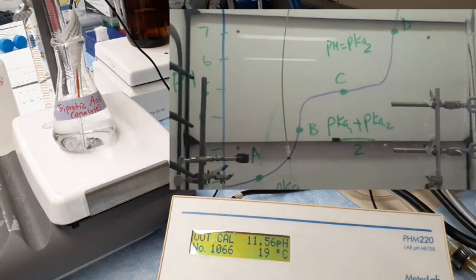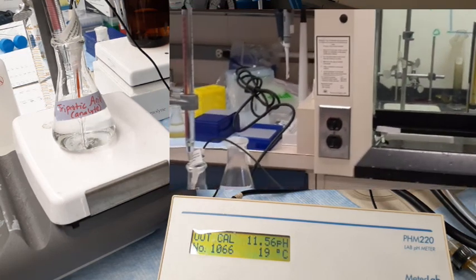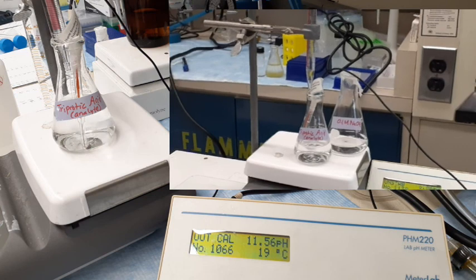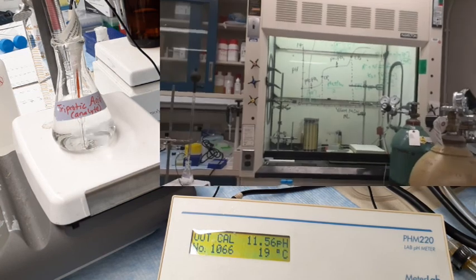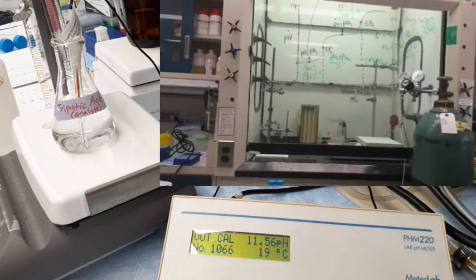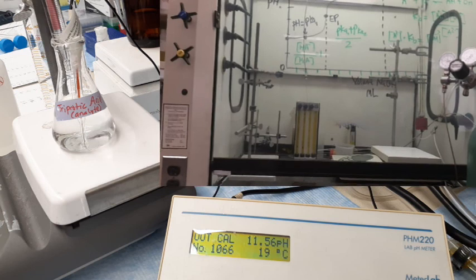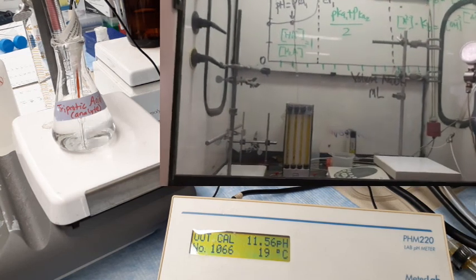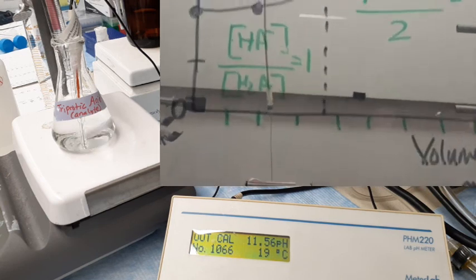So that's the end of our titration. Next step is to plot the pH against the volume of sodium hydroxide added, and from the curve we're going to analyze the pKa1, pKa2, pKa3, and also equivalence point 1, equivalence point 2, and equivalence point 3.